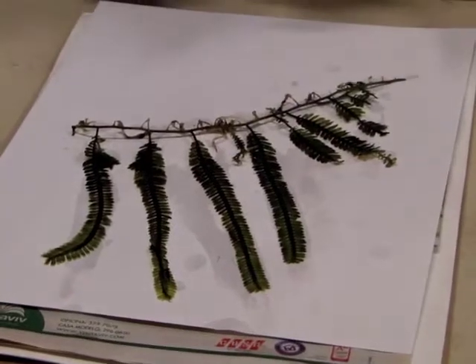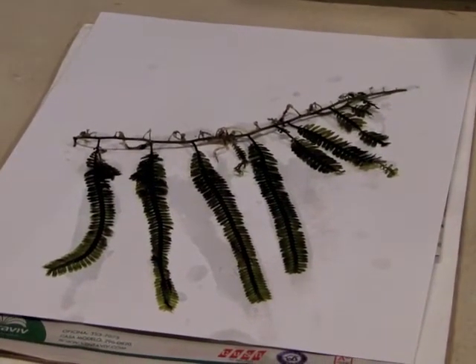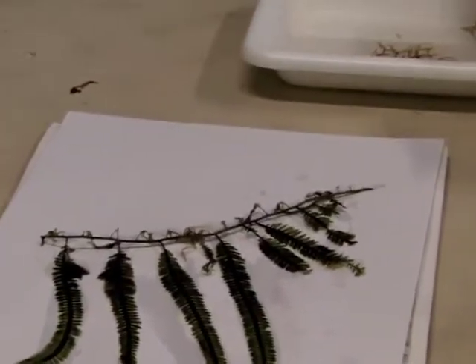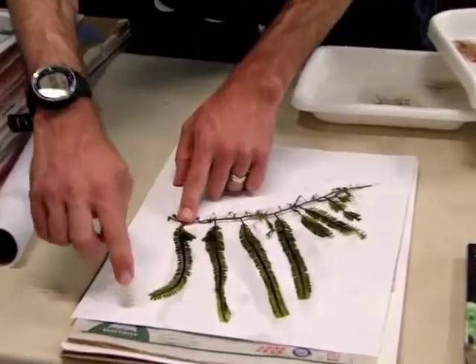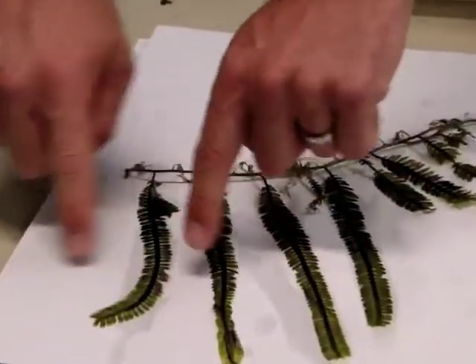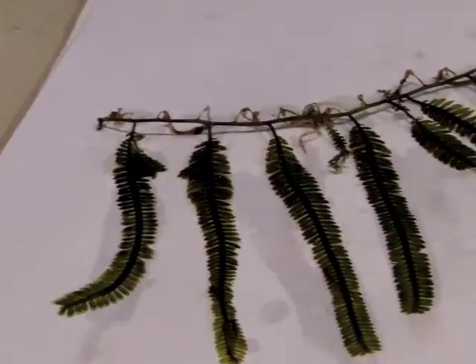The arrangement of the specimen on the paper helps us to understand more about the morphology, or the shape and appearance, of the algae. For instance, in this specimen we can see that it consists of upright branches with opposite branchlets coming out — they're paired along either side of the main axis. Those are some of the features that we might use to separate different species of algae.